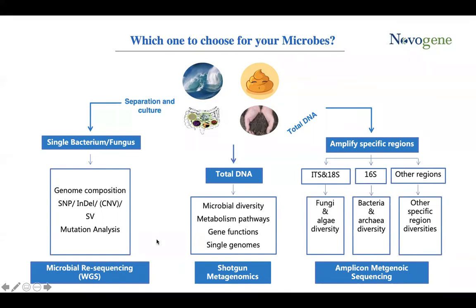Okay, let's see another question. This question is from Magali. Good morning, can we send the DNA samples for sequencing? Yes, absolutely. We accept DNA, PCR products, or tissues to do this amplicon sequencing.